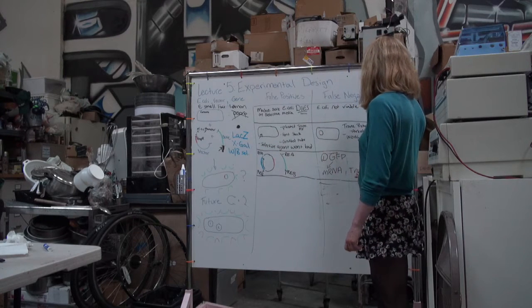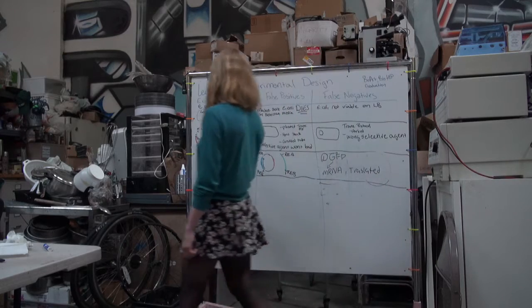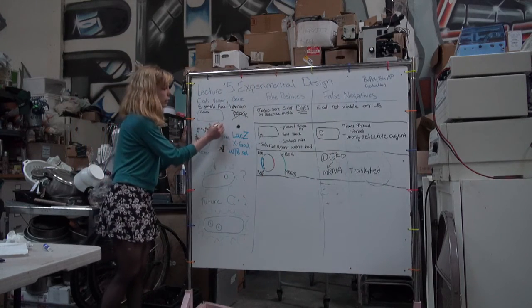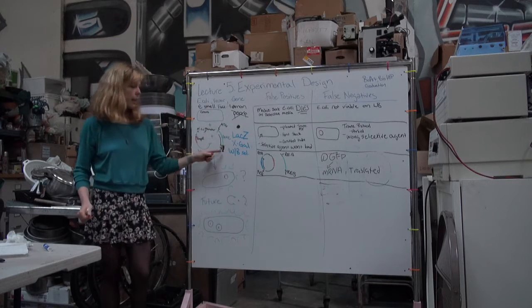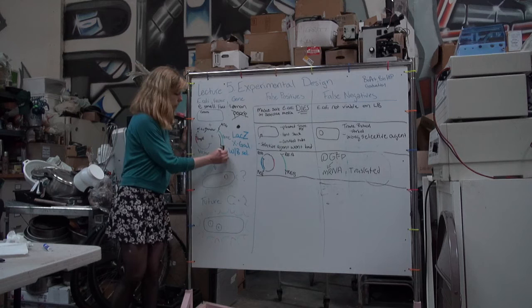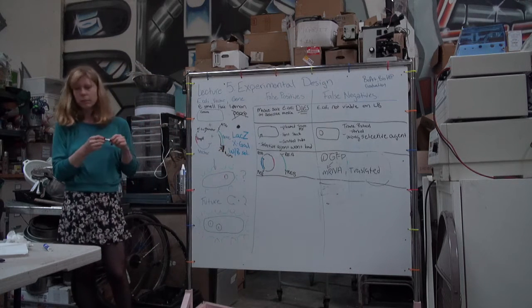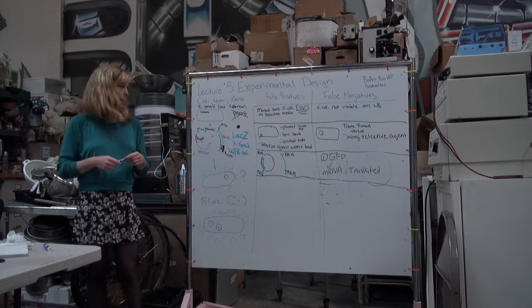And the way that we know it's being translated is that you tend to put your GFP at the end of your gene. So the start ATG, methionine, is on this end, and at the very end, you have this tag. It tags along at the end. And you don't need another promoter; you want to make sure that it works under this promoter. Okay.